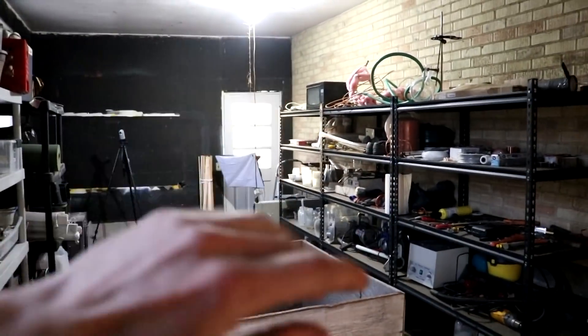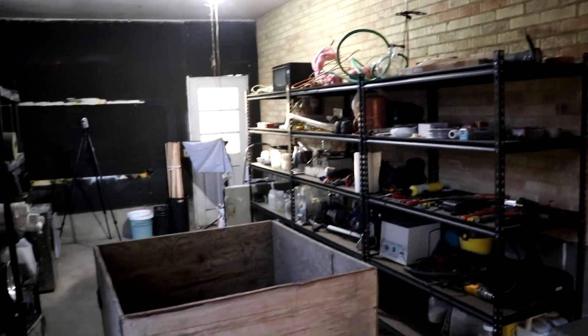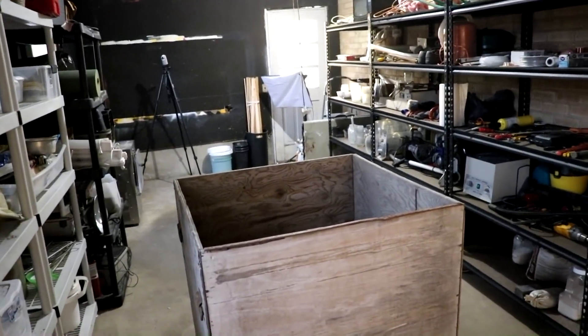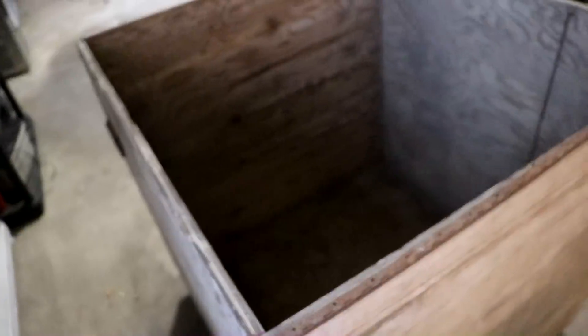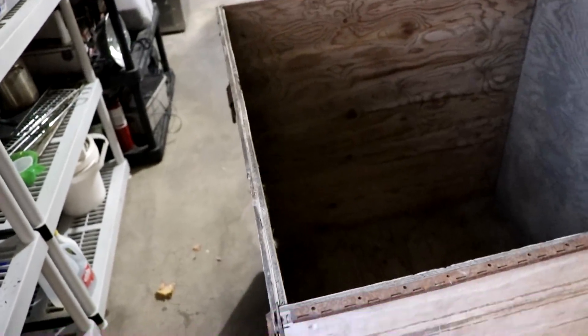Welcome back to Cody's Lab — this is actually my lab; I don't really show it a whole lot. I want to upgrade and get a fume hood, and this box in the middle of the room is going to be the fume hood. I don't really know what it was originally for — it's just thick plywood — but I think it will work.